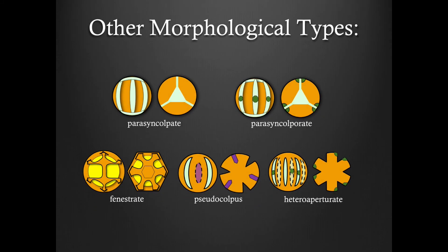Here are some more unique morphological types. Parasyncolpate and parasyncolporate refers to colpate or colporate grains where the colpi are split and attached to the adjacent colpi, creating a triangular shape at the pole. Fenestrate, also referred to as lophate, refers to grains that have large window-like areas covering its surface. Pseudocolpate refers to a colpate-like pseudo-aperture that is present in heteroaperturate pollen grains, and it is assumed to be nonfunctional. Heteroaperturate refers to grains with two different types of apertures present on the grain — the term typically applies to pollen grains with alternating colpi and colpori, although it could also describe a grain with two different types of colpi or alternating pores and colpi.